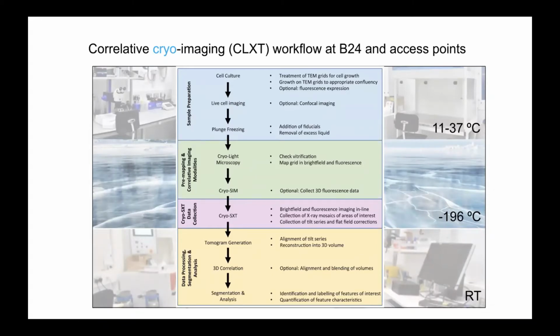So, all right, the only other thing that I wanted to say is that people can access this workflow at any point. There's no requirement to start at cell culture with us. It could be that somebody prepares their samples, does their cell culture, maybe they have experienced facilities to do their plunge freezing, and then send it here. Some people just access the cryoSIM, for example. Some people just access the X-ray microscope. Some people just get in touch with us to give them protocols and help with the processing. So users can interface with this workflow at any point.